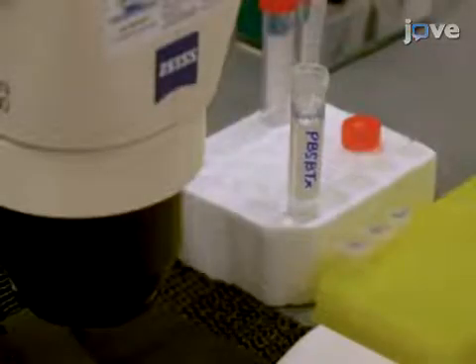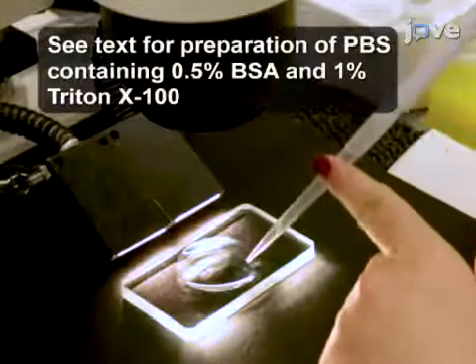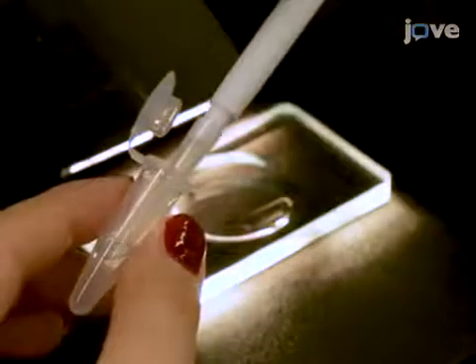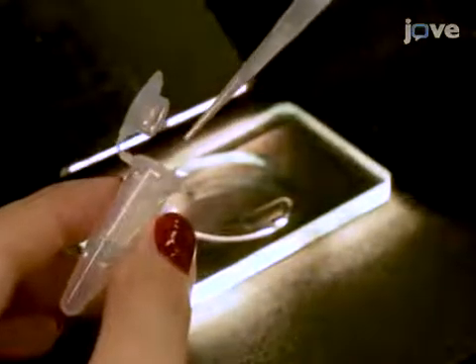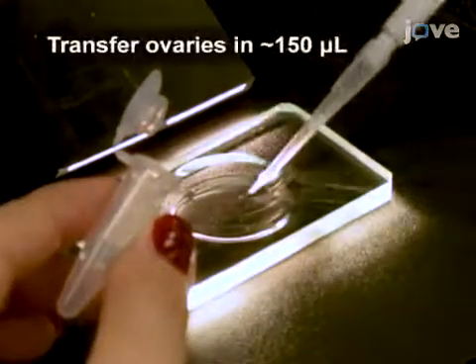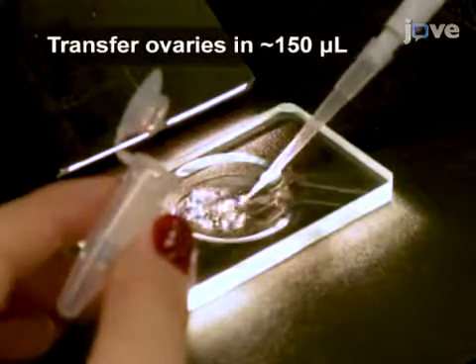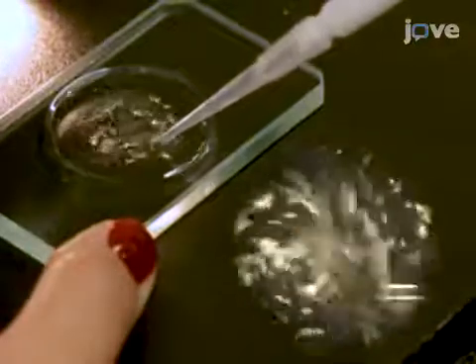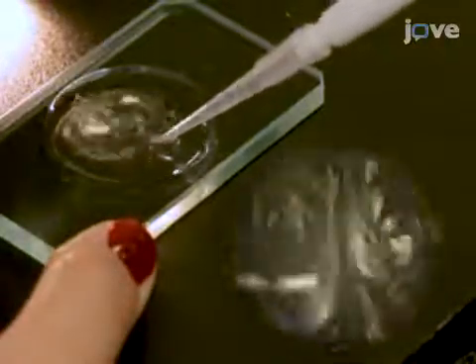To separate the late-stage oocytes, first add 1 ml of PBSBTX to a shallow dissecting dish. Then use a P200 with a BSA-coated tip to transfer fixed ovaries into the shallow dish. Pipette the ovaries up and down with the BSA-coated pipette tip to dislodge the mature oocytes from the less mature oocytes.